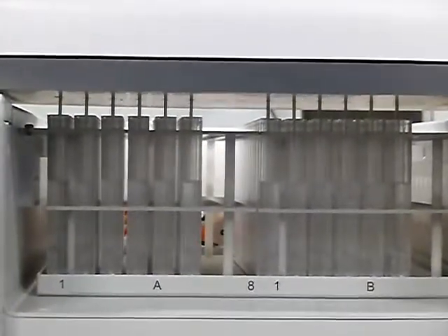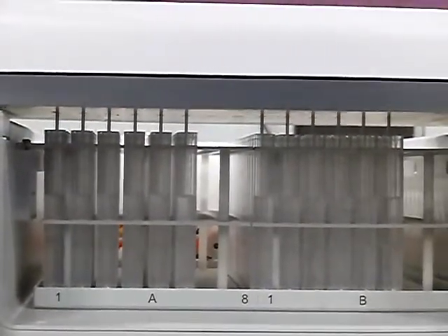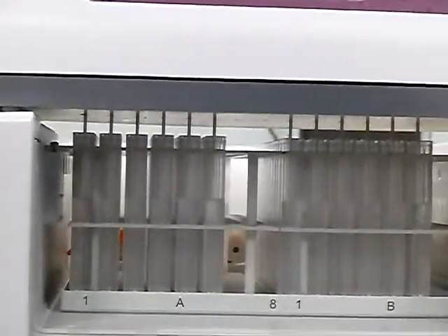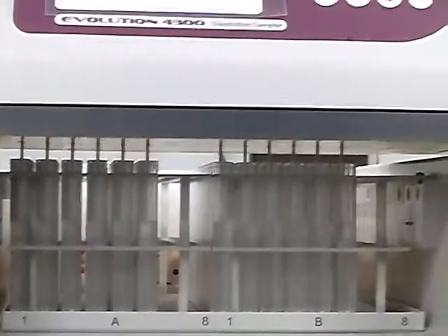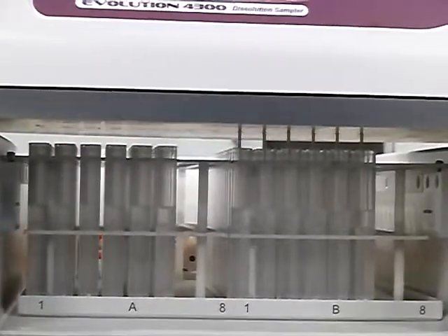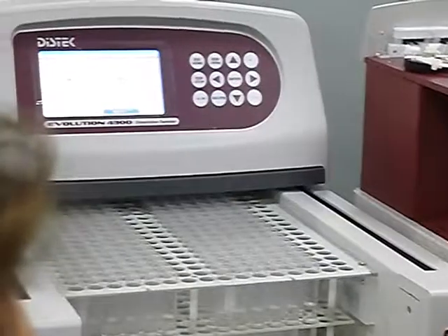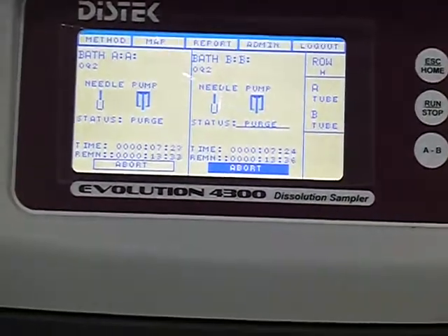Yeah, so it does its 5 and a 4, so the total is 9 mils, and you have recycle turned off, or recycle on but replace off. Then each of these probes is going to be sitting in its own individual little beaker. Do you have those in your kit? Yeah, those are the white ones you see sitting behind my bags there. They fit 250 perfectly, they have lids with a hole in the center so each probe sits in those. And that's where I should only have 9 mils, and usually you're running 9.2, 9.3, 9.4.